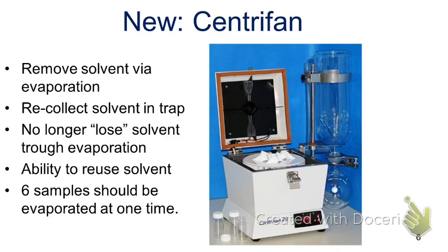We'll talk about that a little bit. And then you no longer lose that solvent to the atmosphere. Safety-wise, it's better because you're not breathing it in. And then further, you can collect and reuse that solvent. Okay? So you spent X amount of dollars on that solvent. Now you can reuse it or use it multiple times, get more value for your money.